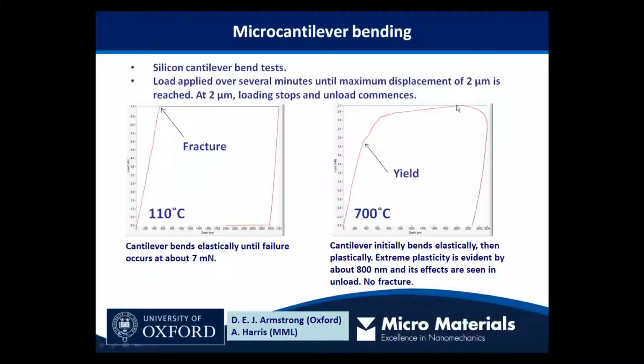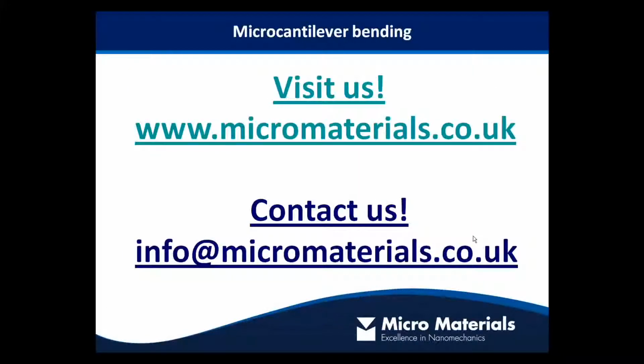We actually stop loading when we reach 2 microns. We define that in our experiment details, and then we start to unload. And as we saw, even with the micropillars, as we start to unload, even though we're reducing the load, we still get some ongoing deformation of the cantilever. But in this case, the cantilever has not cracked.